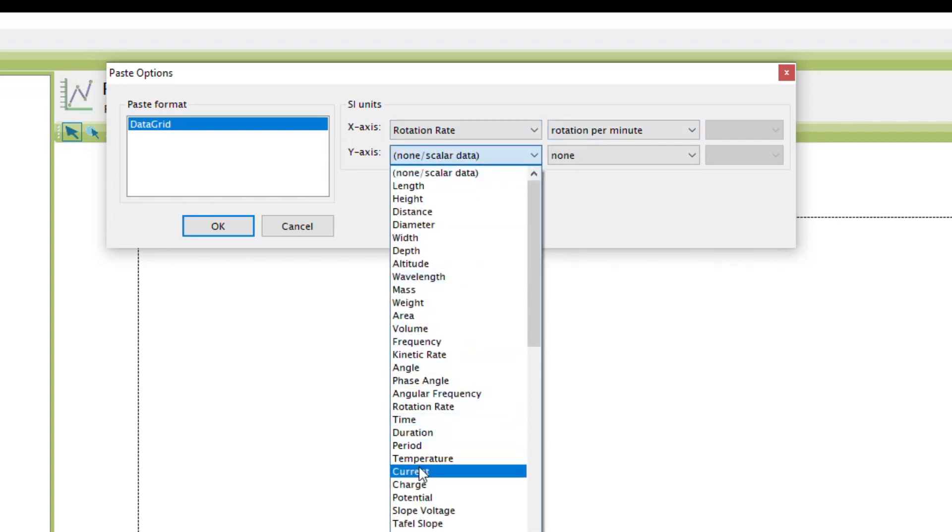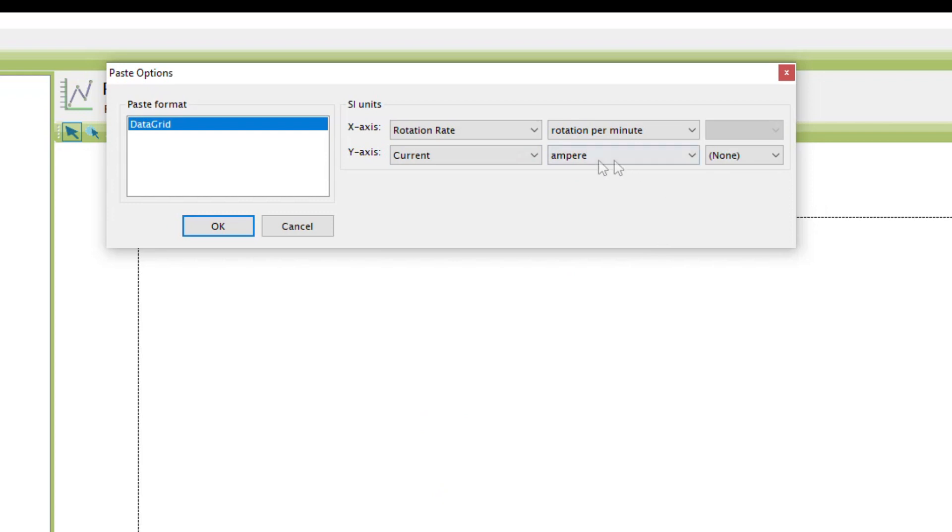And then on the y-axis, the units are current. They're in amps, but I actually have microamps, so the current's in amps, but I can actually change the prefix to micro.